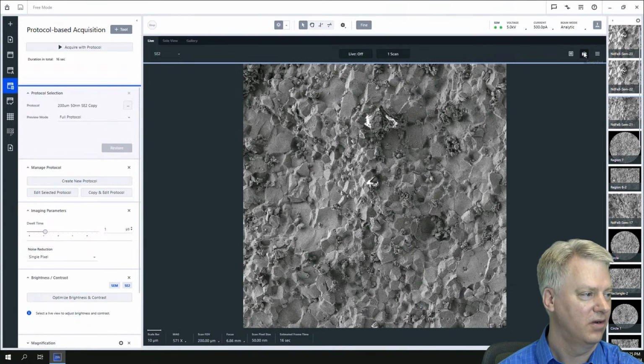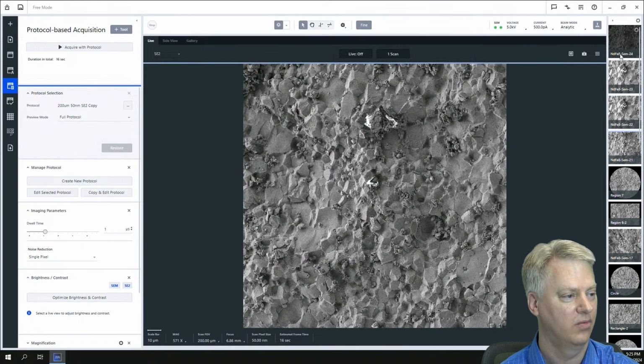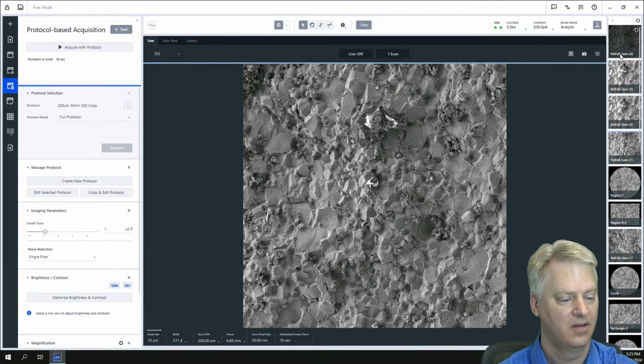So everything's looking good here. If I wanted to take an image with the protocol, I can. So it's kind of useful where if you wanted within ZenCore EM to take individual images with a specific protocol and set it up, you can, and then it dumps the image out here, and then it becomes part of what you have within Zen, that you can either save individual images or the project itself. And of course, each of these are being added onto the correlative workbench, so we'll show that later once we have a bit more.